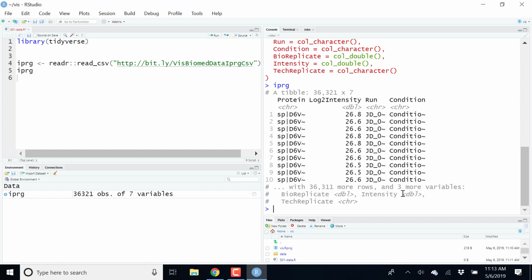And these quantitative data were distributed to many different labs. These labs were asked to analyze the data and identify the proteins that were differentially expressed, these spiked-in proteins that were spiked in at different concentrations. So the protein names were anonymized, and different labs had to identify these differentially expressed spiked-in proteins.